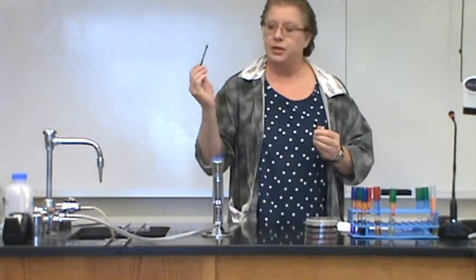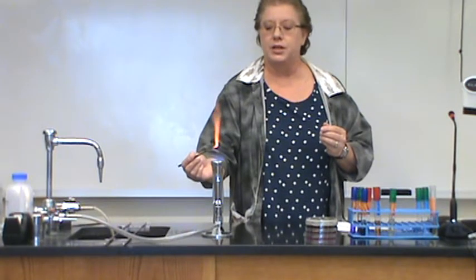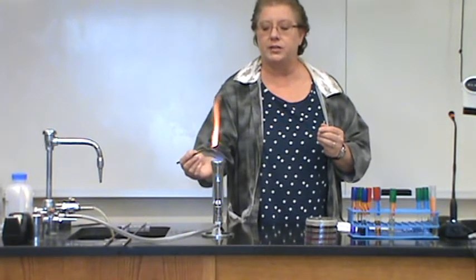So we're going to inoculate each of these simply using our loop and the simple technique we used in aseptic technique to inoculate a broth.